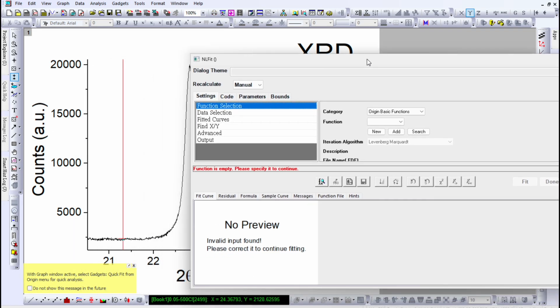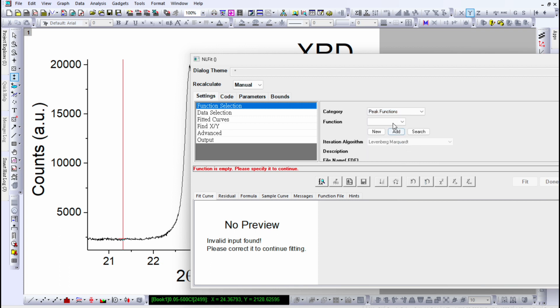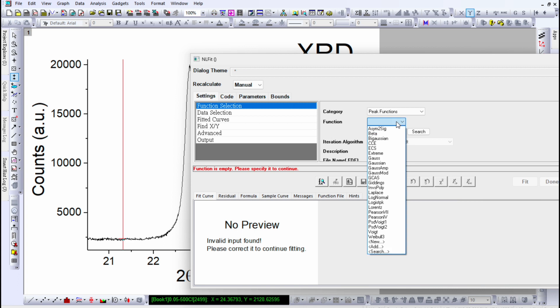Now you will see on the settings side there are options for function selection, data selection, fitted curve, and related settings. Under function selection, the category is originally set to basic function. Instead of that, go to the peak function category. In the peak function you will see a Gaussian peak function or a Lorentzian peak function. First, choose the Gaussian peak function.